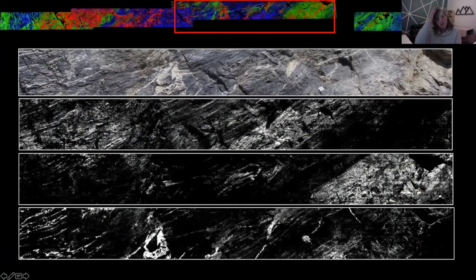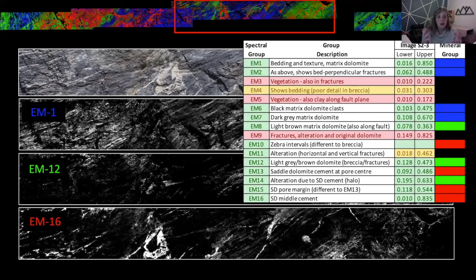So in spectral angle mapping, basically you are running statistics on the spectra and looking at the angle of reflectance and how intense that is. And it will look at the entire spectra itself as well, the compositional and more textural end, and run an analysis looking for similarities and differences in order to put them into groups. And finally, the way that we did this was we had basically 16 spectral groups that we analyzed. These were provided to me from Dr. Brevard and Dr. Fang. And I worked with Jack Stacey to go through these different groups and decide which of the spectral groups represented what phases and whether they should be grouped or whether they should be eliminated or split.